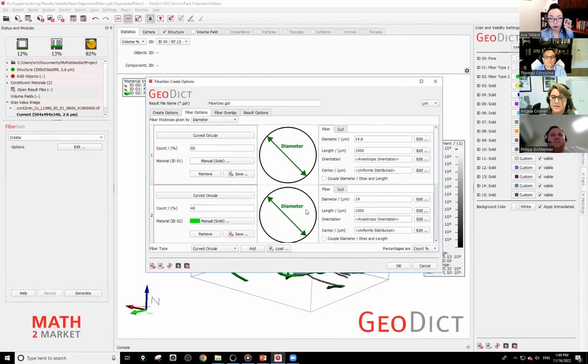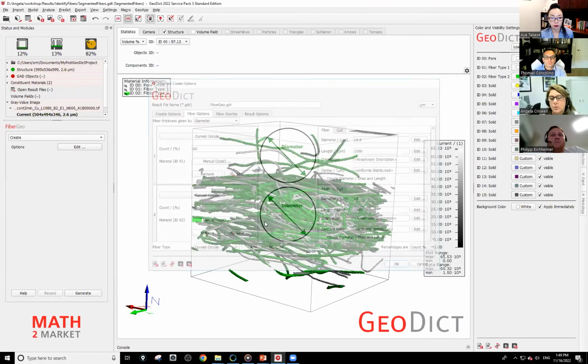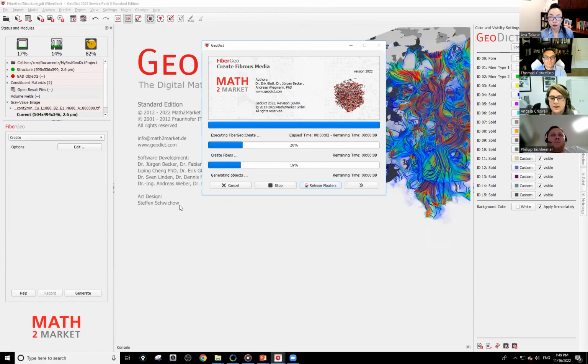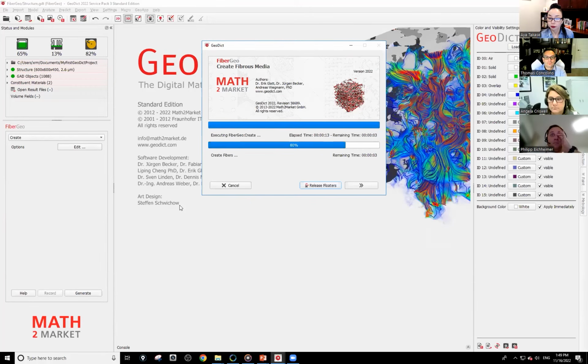We could just ask the question, if I use the default curliness option, what do they look like? Are we even in the general category of likeness? So we can quickly look at that, and it turns out it's really quick to run. So we can do that live with you. So close.